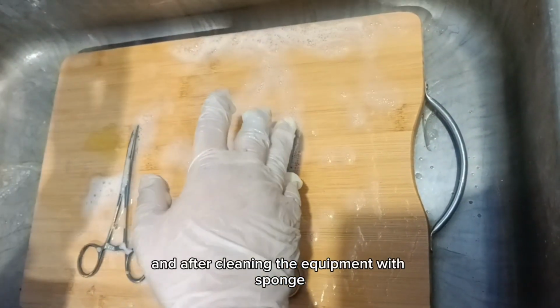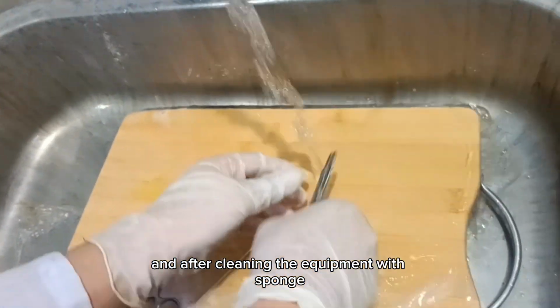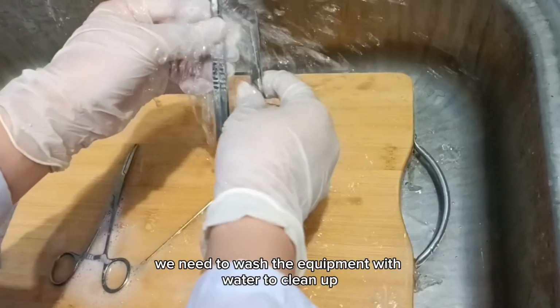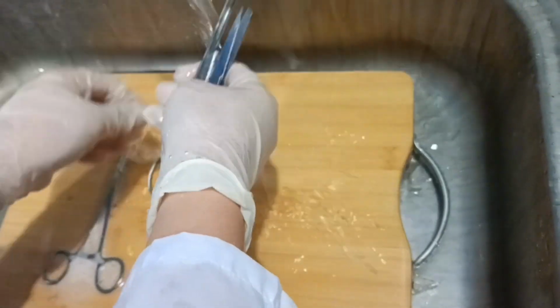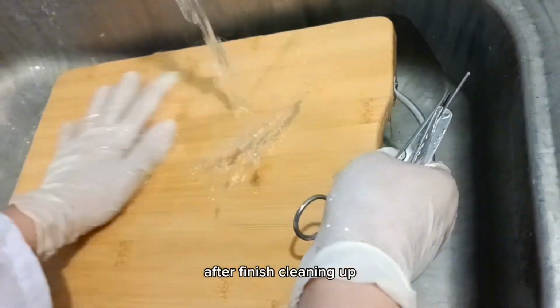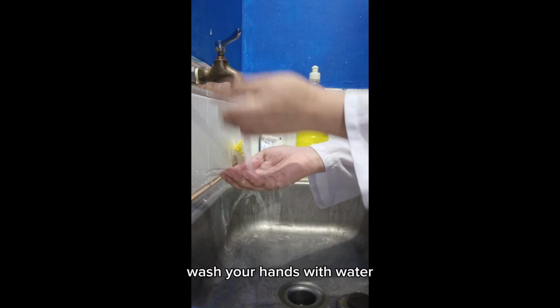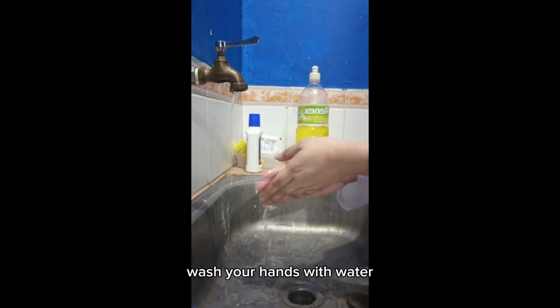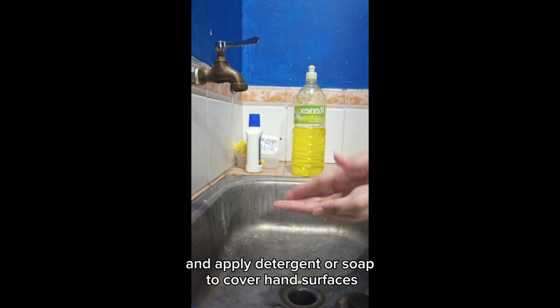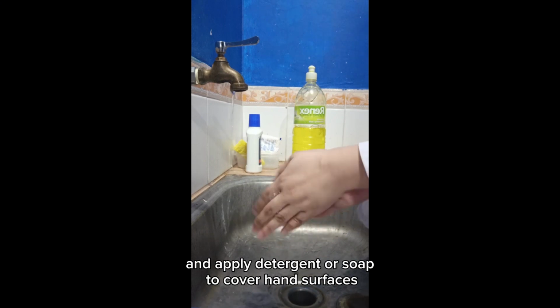And after cleaning the equipment with the sponge, we need to wash the equipment with water. After finishing cleaning up, wash your hands with water and apply detergent or soap to cover the hand surfaces.